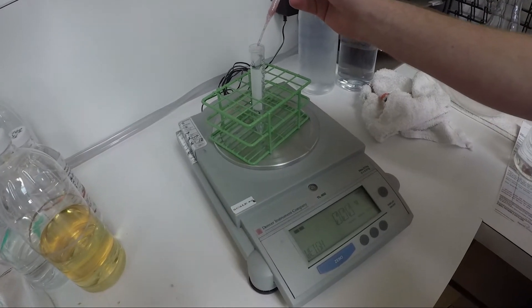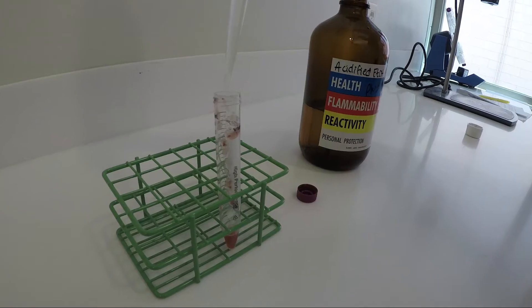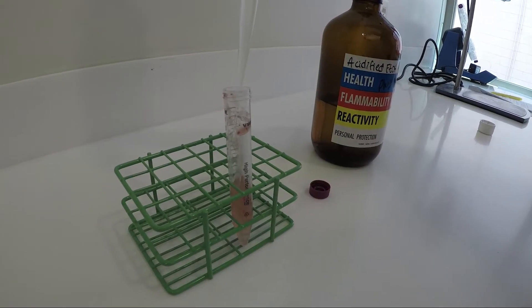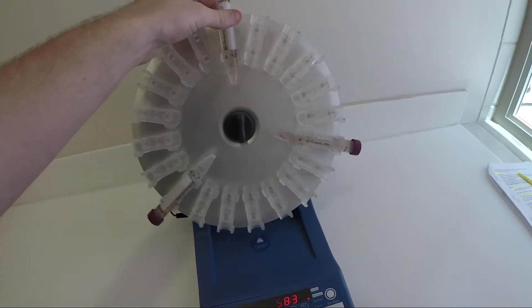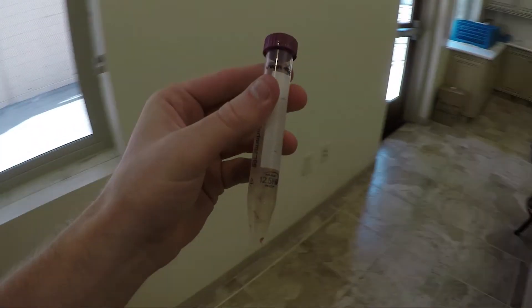Weigh one gram of homogenate into a centrifuge tube. Add 10 mils of acidified ethanol. We'll undergo a one hour extraction while mixing. If you don't have the budget for a loopster, you can also entertain a co-worker.